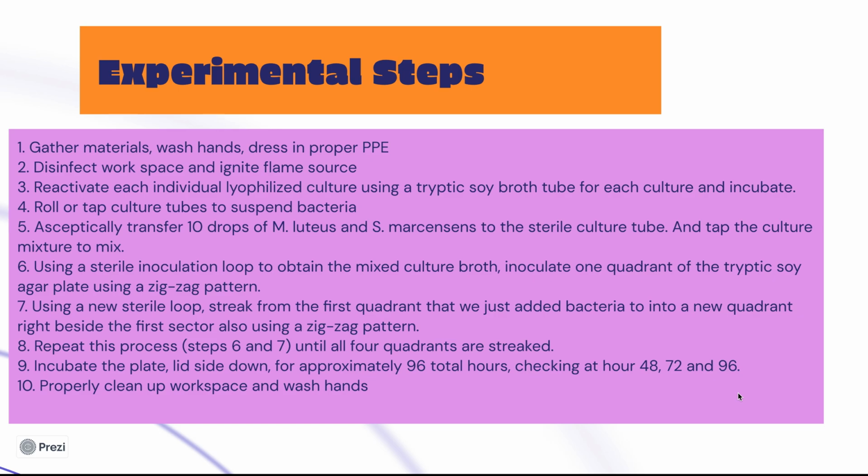You're also going to be disinfecting your workspace and then igniting your flame source. For me, I used the candle, and I used the lighter to ignite that. Third step, we're going to be reactivating the cultures.